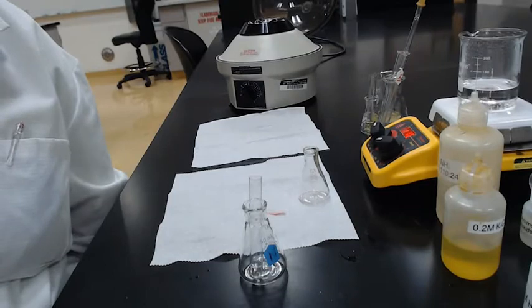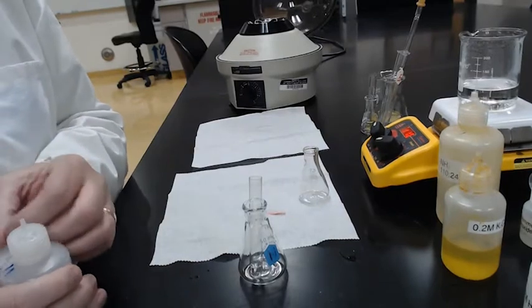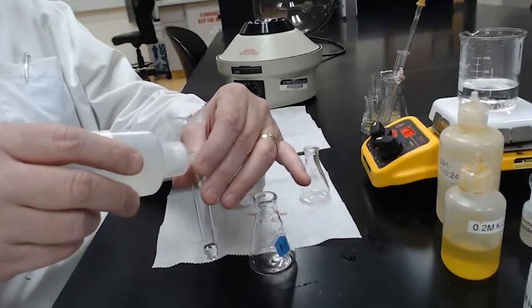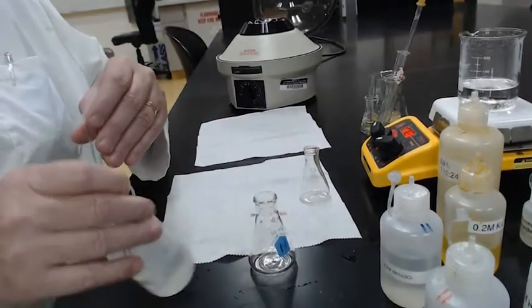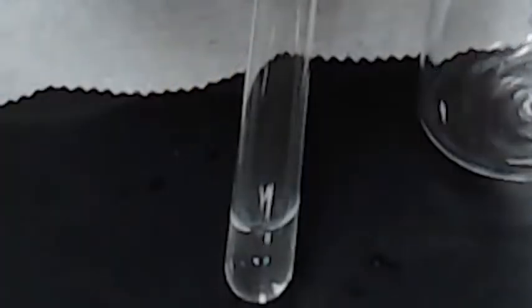Okay, so we have it. We're going to add 2 drops of ammonium sulfate first. And then we're going to add some ammonium and boil. The purpose is that the sulfate and the oxalate will precipitate if we accidentally left any barium or calcium in here. So there's my sulfate. That looks good. No solid. Where's my oxalate? We're now going to add some oxalate and look for solid. And it looks pretty good. Is there any haziness? What do we say? When in doubt, centrifuge. And I have a tiny bit.